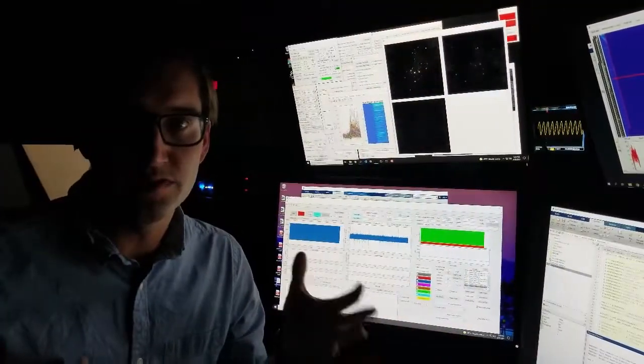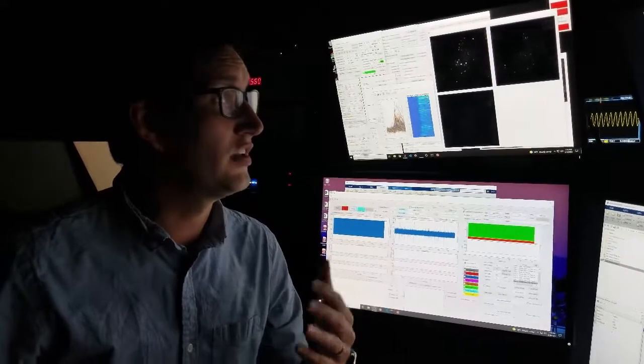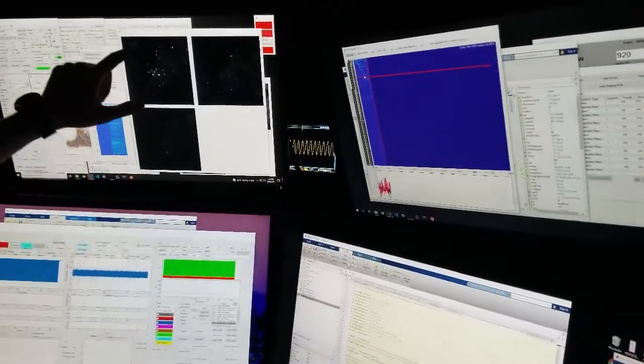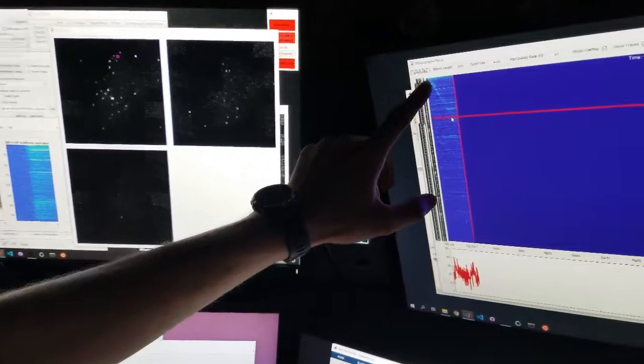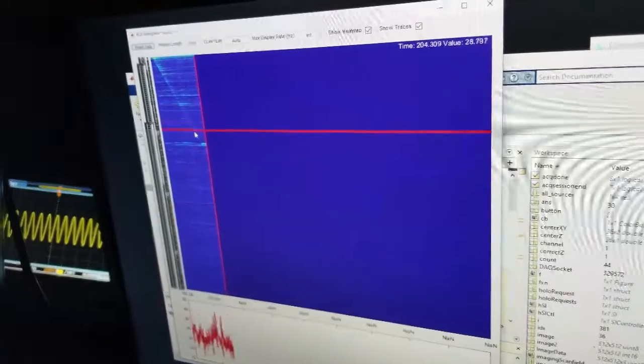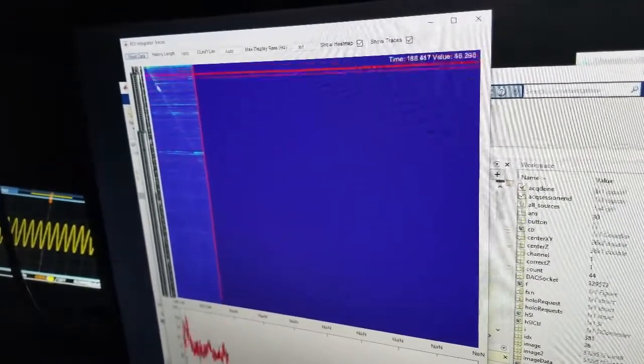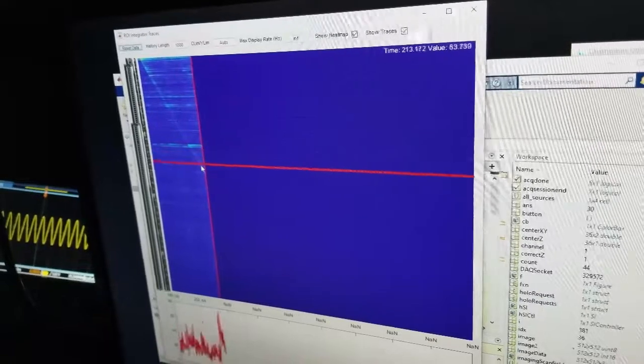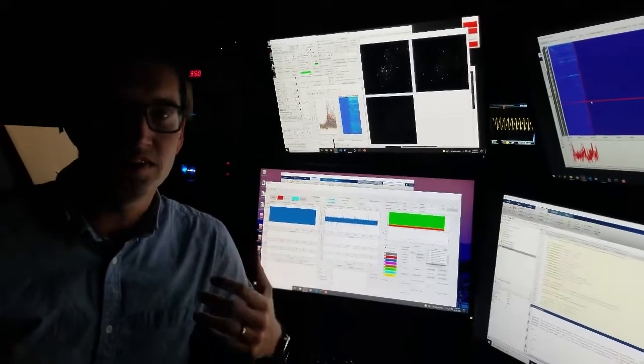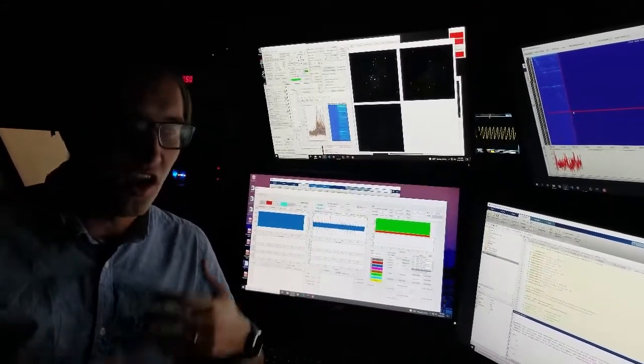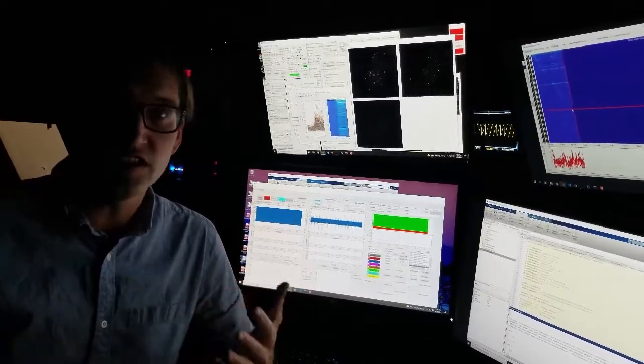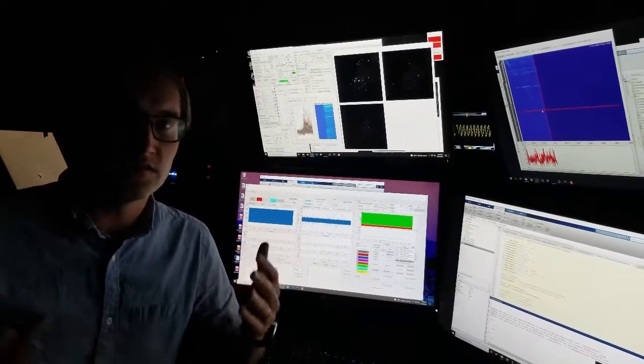So now we have a mouse under the rig, and we're stimulating individual neurons one at a time. We have nearly 300 neurons that have been identified as opsin positive, so you can see them all through here. And if you come over here, you look at each of those neurons being stimulated one at a time. And you can see that while not every neuron is responsive, the vast majority of them are activated exactly when we want them to be. So this sets up the framework by which we can start asking questions about how patterns of activity can give rise to all of the phenomena that the brain does. We at the Adesnick Lab are especially interested in how it affects vision and perception, but this can be used for a wide array of questions.